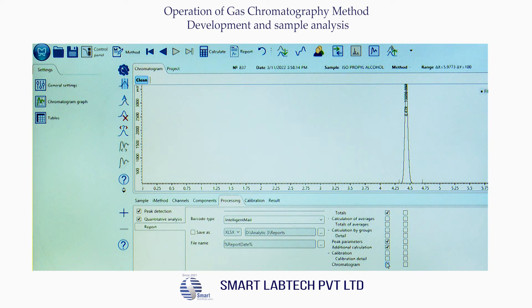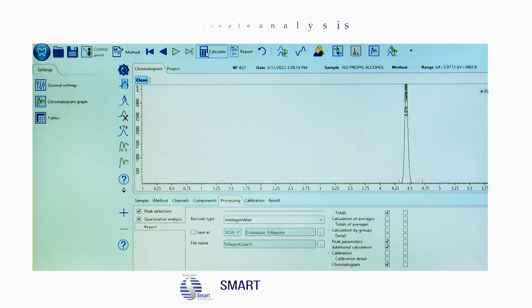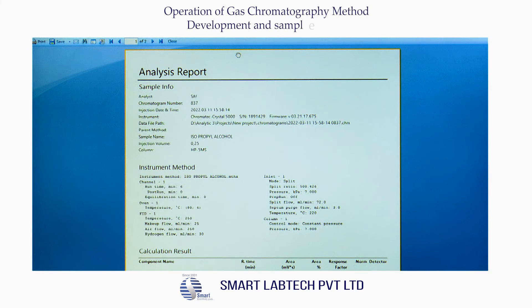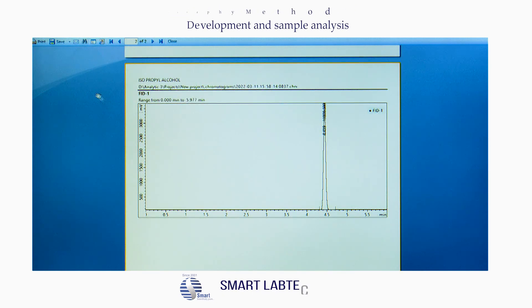Finally, click the Calculate icon on the top panel, then click the Report icon on the top panel. The analysis report appears on the screen. Click the Save button to save the chromatogram, then click Print to take the chromatogram printout.